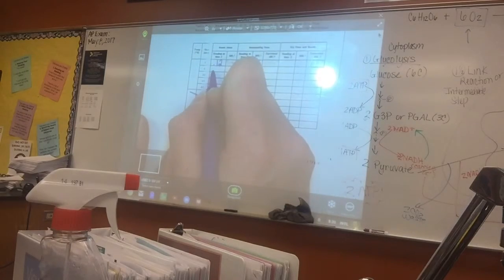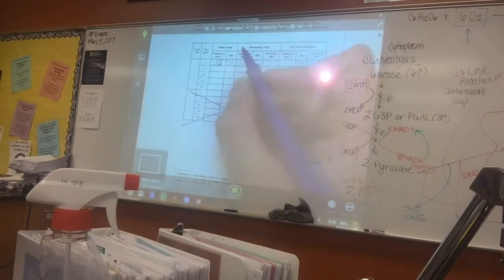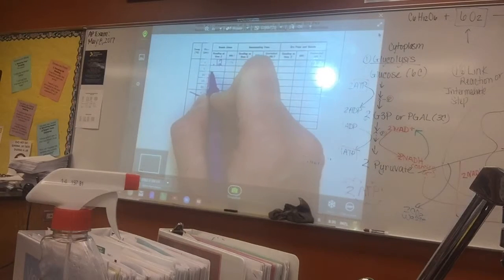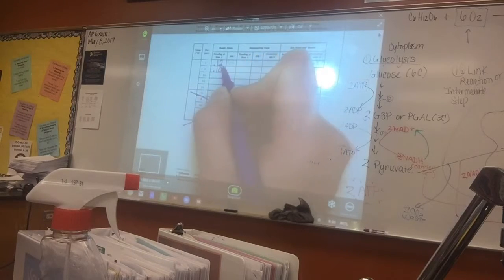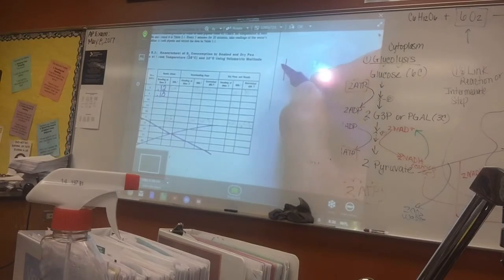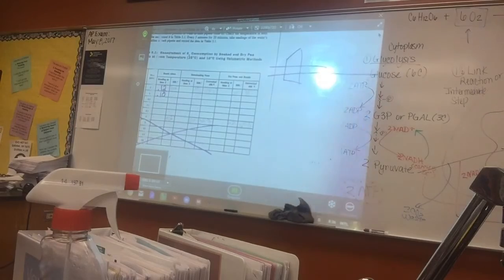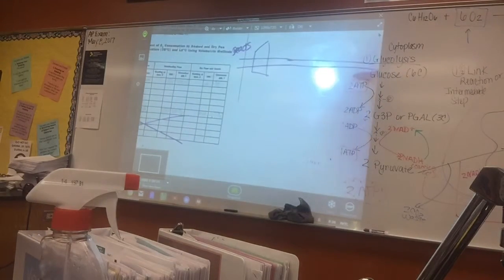And so it could be a change in temperature as well. Our water baths, though, were hopefully pretty stable. But let's say it did move. And so after 5 minutes, let's say our reading was 0.10. So in looking at this, if this was the stopper, here's your pipette, and this is your beads down here. What that meant is that here's 0.12, that it went in to 0.10. So the water went in. That's how we read it.